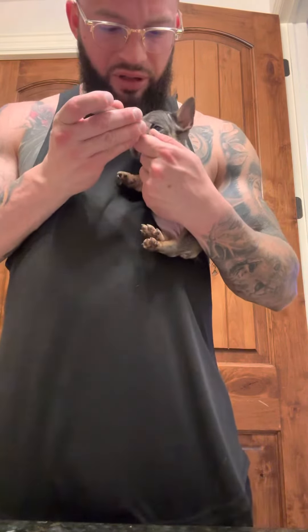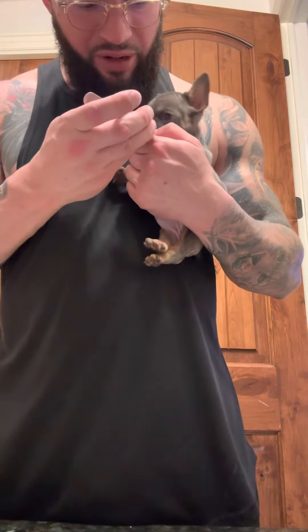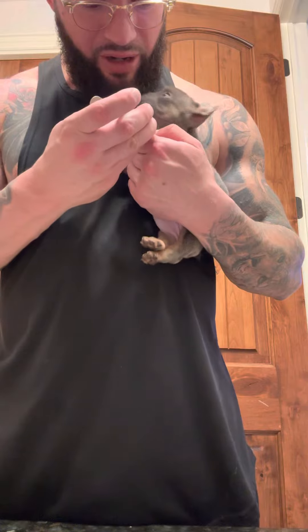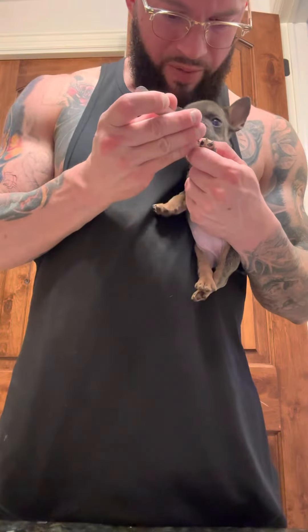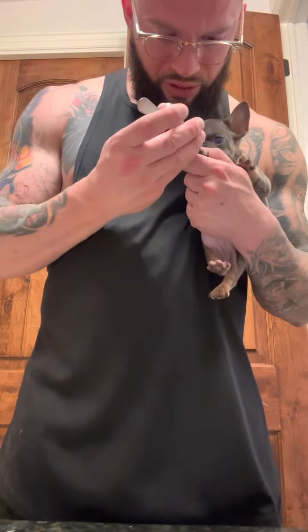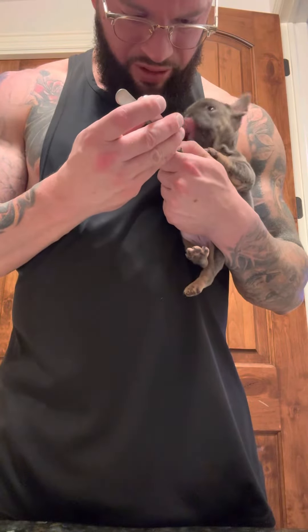We're going to start by cutting the nails — just a little short, just trying to nick it just a hair to get a little bit of blood. You don't want a lot, so do not cut it too short. Just do a little at a time. I'm doing all the nails as well, just so they have nice short trimmed nails, because puppy nails do hurt.